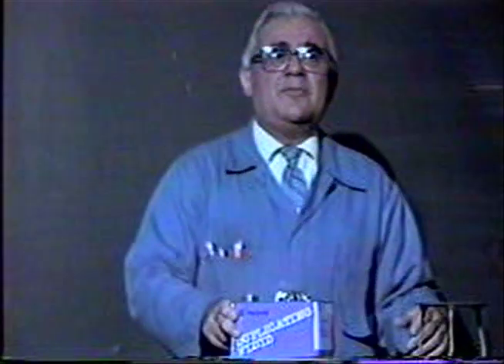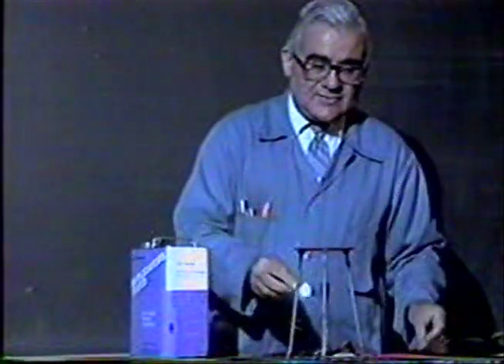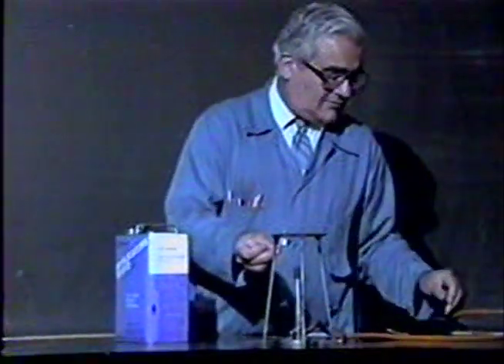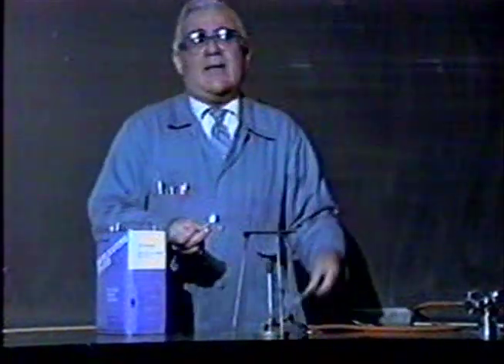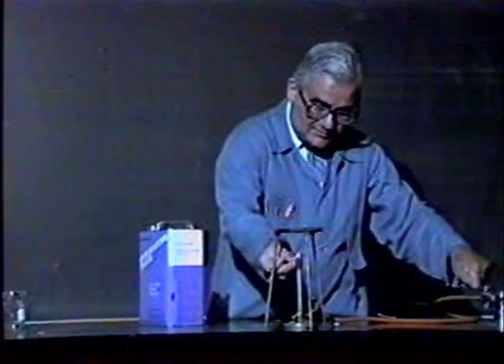Then I'm going to take the can off the Bunsen burner, put a stopper on it, allow it to cool, and the steam will condense back to water. It won't take up very much room, and there will be a part of the can that has a vacuum. What will happen is the can will crush inward. First thing we'll do is light the Bunsen burner. This piece of equipment next to it is called a tripod — it's like a stand — and this is wire gauze so that we can rest something on it.